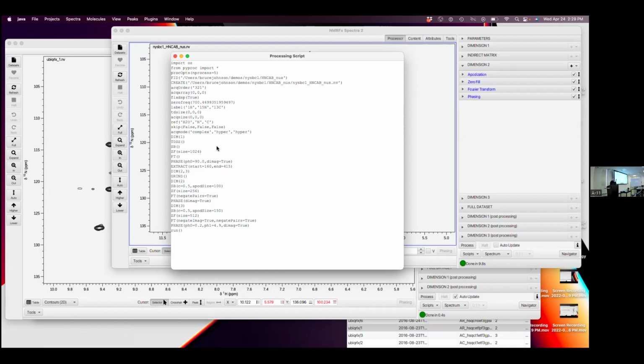But yeah, this won't run in Python itself, but you could go and edit these like we were doing in the NMRPipe script. You can run them from the command line. You can run NMRFX from the command line. So you can type NMRFX -a, if you have that set up, and give it the name of the script, process, without ever going into the GUI.